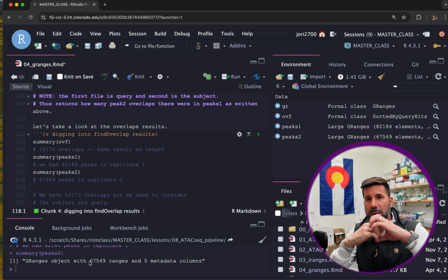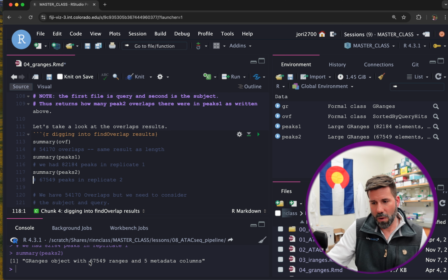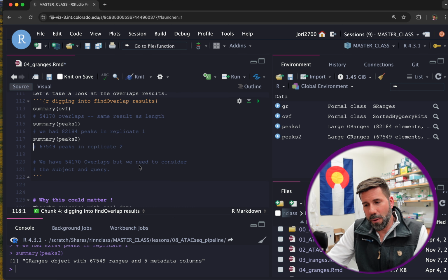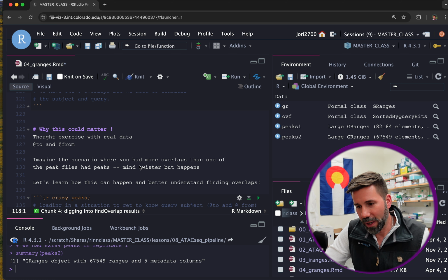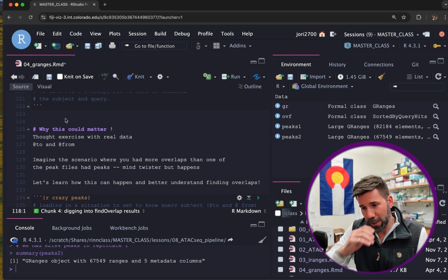But what we saw there basically is the 60,000 were all in there, and then there was about 10-ish thousand that didn't overlap between the 2. Okay, and now why does this matter? I'm not going to go into full detail and consider this an exercise for this video, because the feedback I've gotten is it's super important, but you should really dig into it when it's necessary.